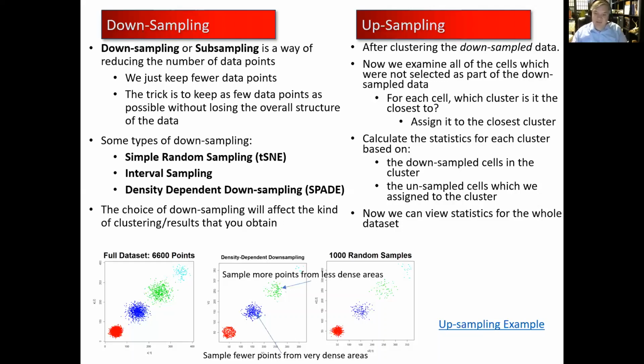But again, we're making estimates when we do that. And the trade-off is, instead of having to wait 3 hours for a t-SNE algorithm to run, maybe we can wait 5 minutes, right, and get our information a little bit more quickly.